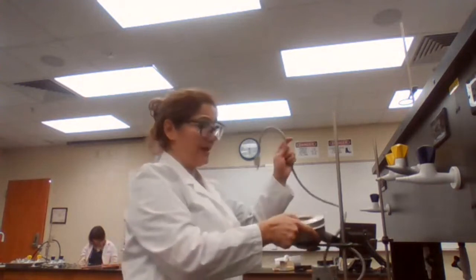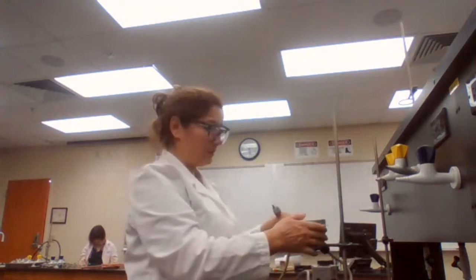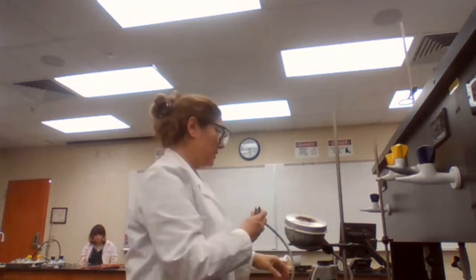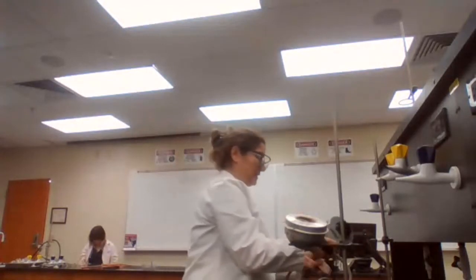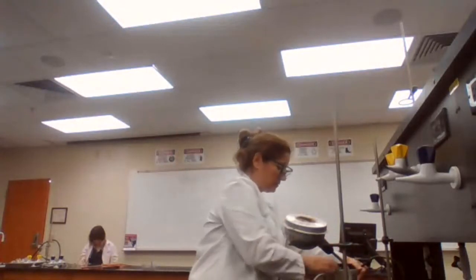You need a heating mantle. These heating mantles are not designed to be connected to the wall, so you should never connect them to the wall. They should be connected to a power regulator. So we have a power regulator that we are going to use and connect the heating mantle to the power regulator.